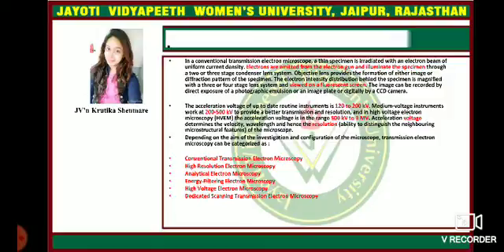The acceleration voltage of up-to-date routine instruments is 120 to 200 kilovolts. Medium voltage instruments work at 200 to 500 kilovolts and provide better transmission and resolution. And in high voltage electron microscopy, the acceleration voltage is in the range of 500 kilovolts to 3 megavolts. Acceleration voltage determines the velocity, wavelength, and hence the resolution of the microscope.